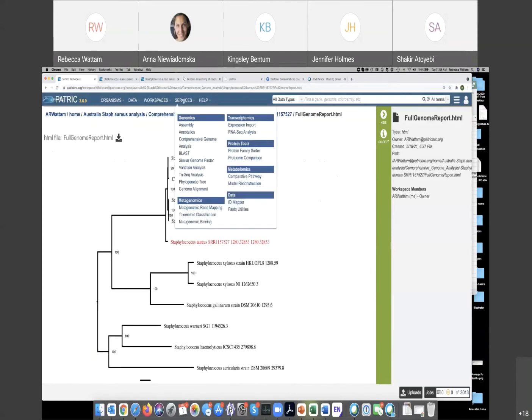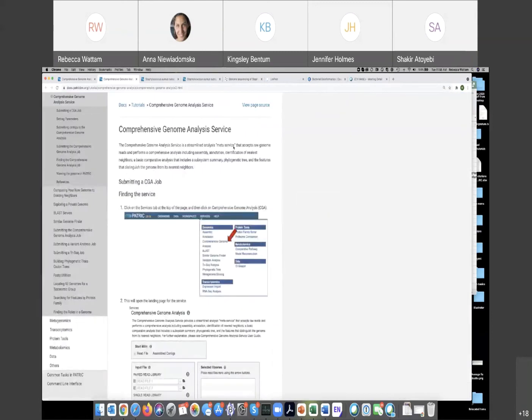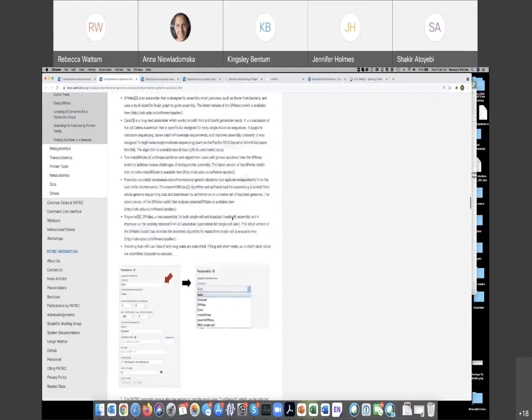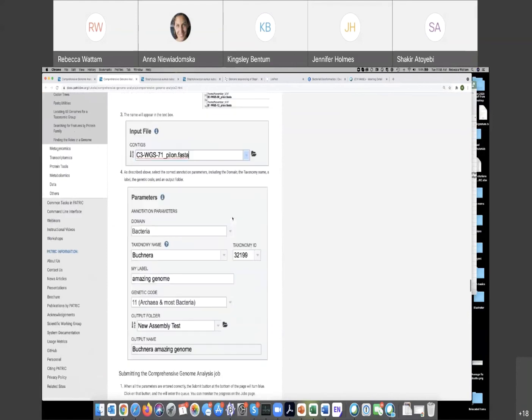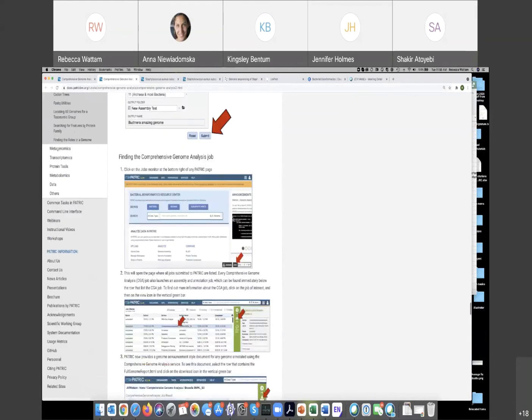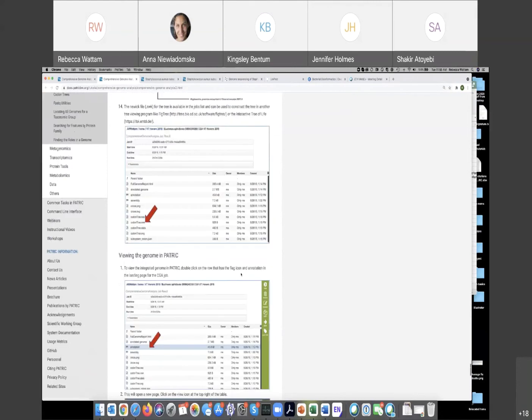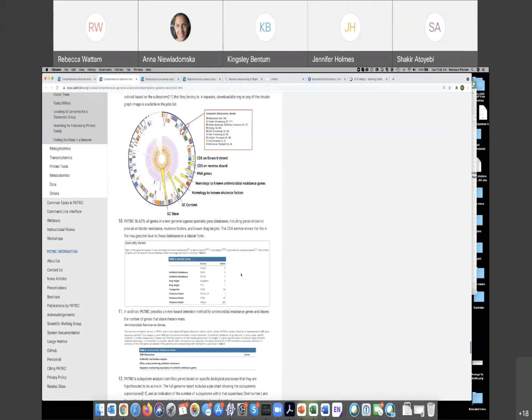Let's go back to this one more thing. You'll see that icon that looks like a library of little books leaning over? I can click on that and it'll open the tutorial that will describe everything that I just described and step you through it with those garish, bold letters that'll make your eyes ache after a while. But it also has the references down at the bottom as well. Okay? So, Steiner et al. did an alignment. They did an assembly.